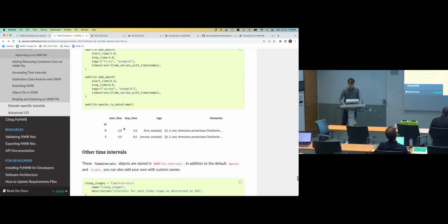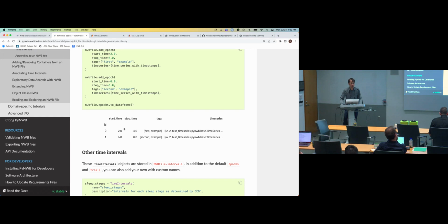Yeah, and that's it for this first talk and tutorial. Do you have any questions about kind of the basics of NWB? And then we'll go into more domain-specific or data type-specific instruction in the next couple talks.